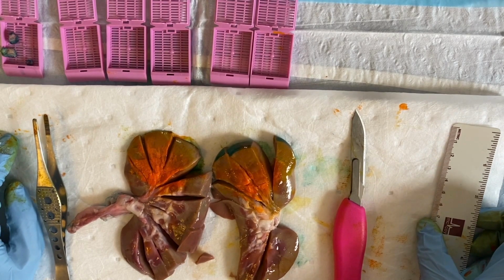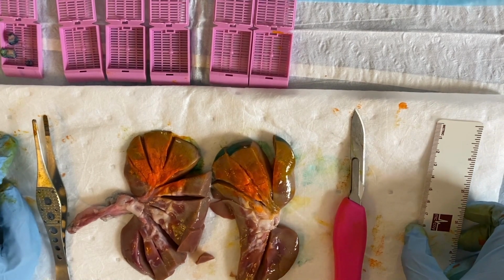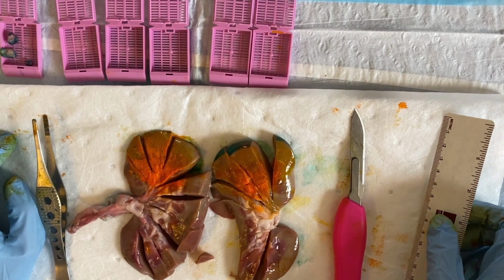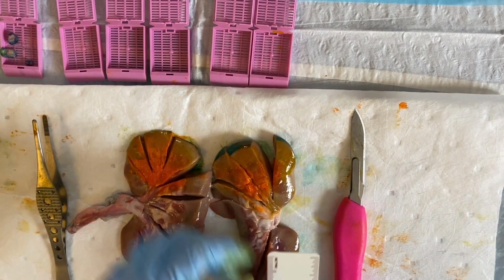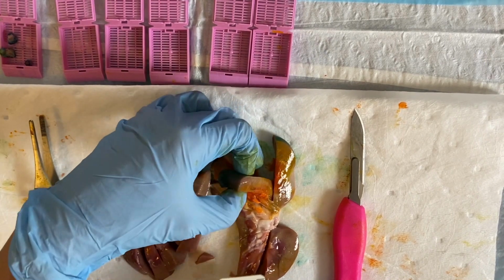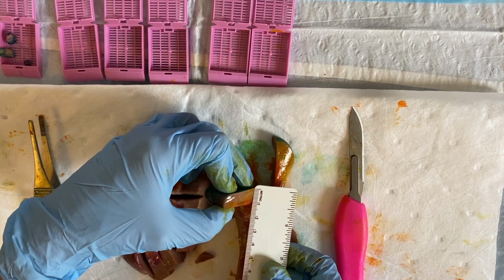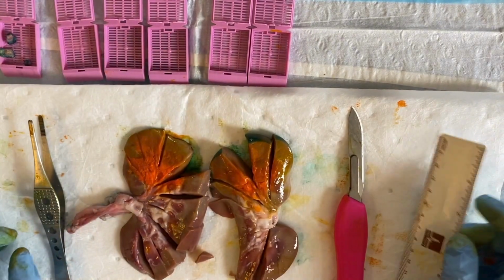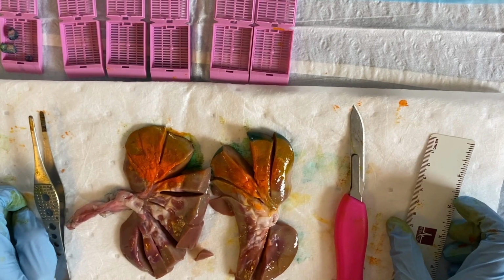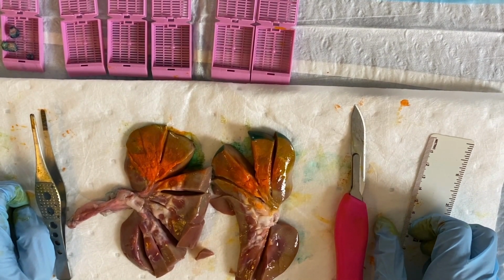I will need to then, after I take my 3 dimensions, measure the distance of the tumor to the outermost surface, in this case, the kidney capsule. So I can see the edge of my orange ink here, and it looks like it is only 0.5 centimeters from the kidney capsule. And of course, I would examine all of my slices to make sure I'm making the most accurate measurement there.